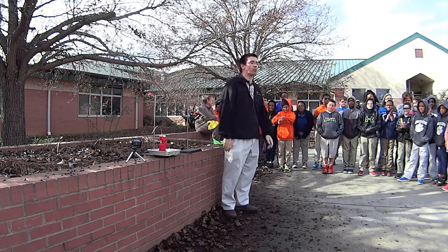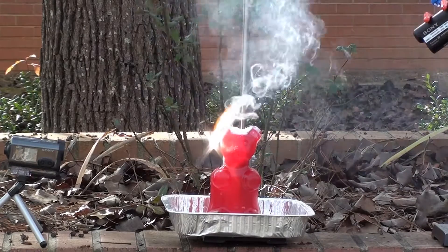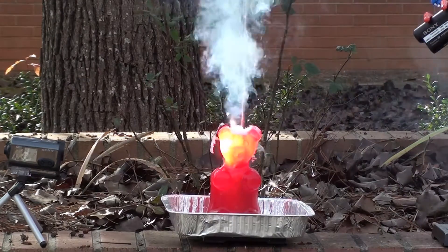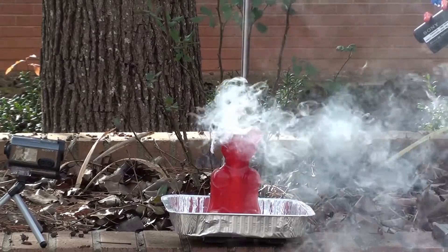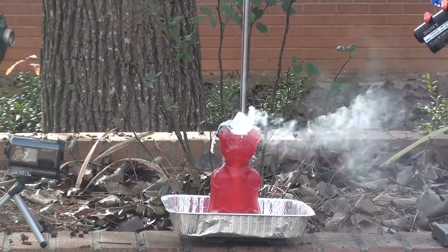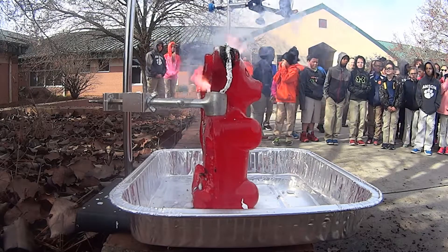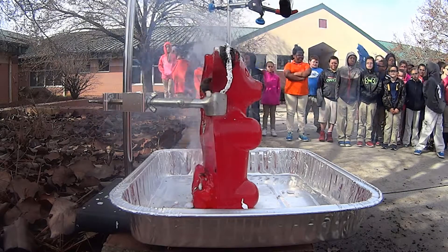Now it's getting there - now we're getting a reaction, so I'm gonna step back. Come on, you can do it! Now we're gonna step back in a minute. It's going, it's working a little bit. We may need to help it out a little bit more. Those of you over here may want to shift around a little bit, come around in front if you need to. We're gonna give this a minute and let that react and see what happens.